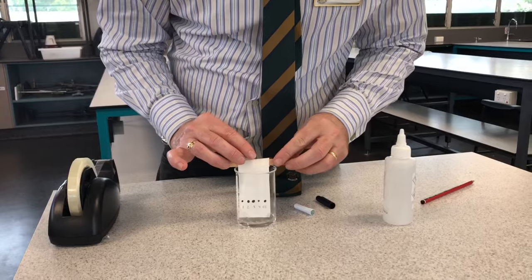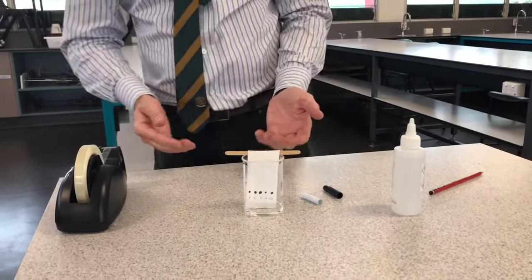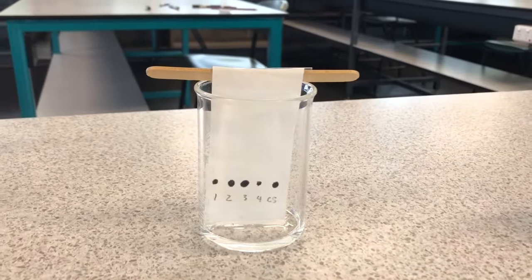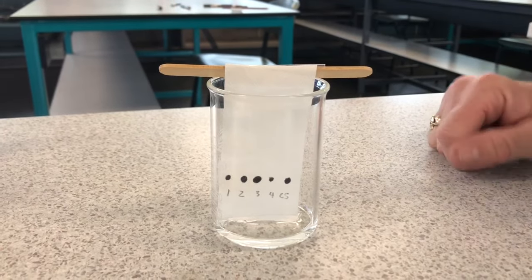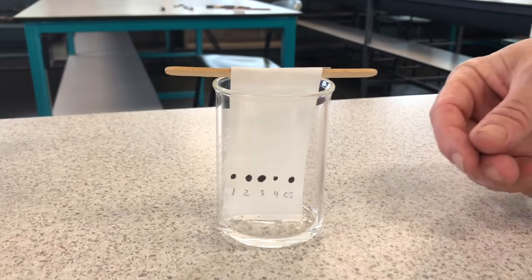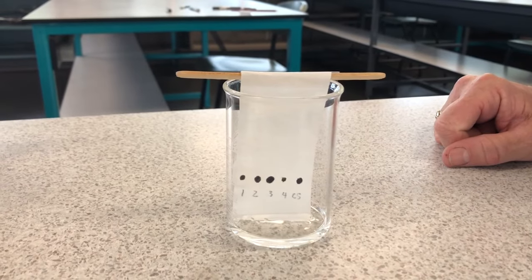I'm putting it in now. You'll see the methylated spirit starts to get drawn up through the filter paper using capillary action. It's going to travel up through our dots of ink and drag the ink upward, separating it into different colors.